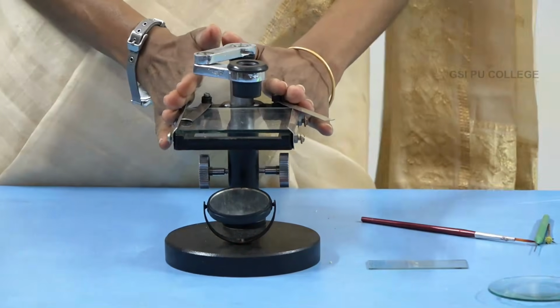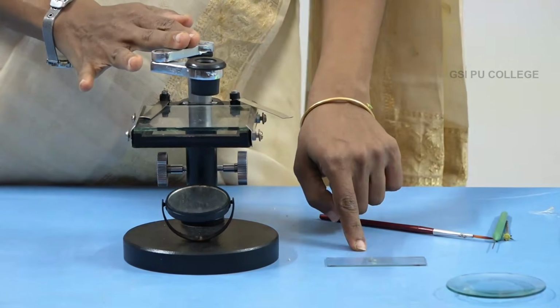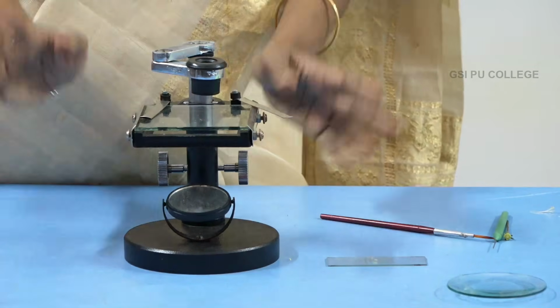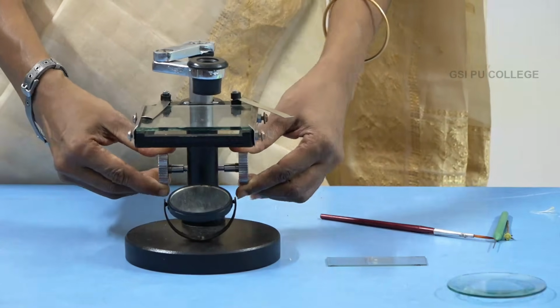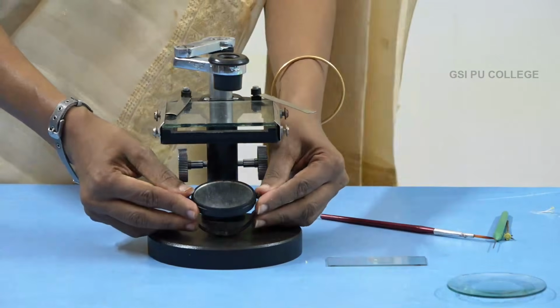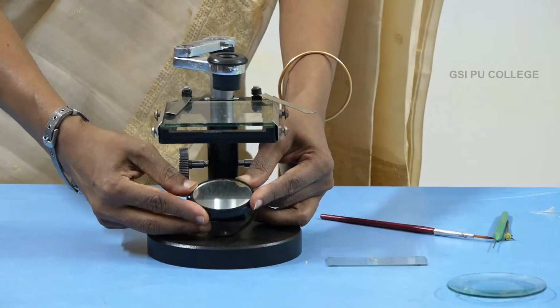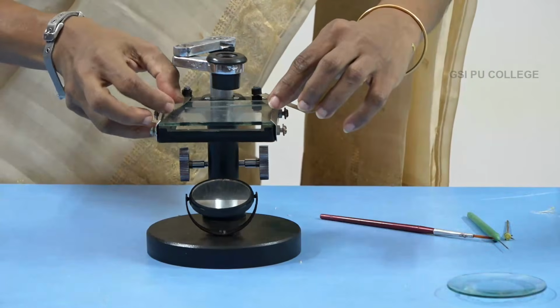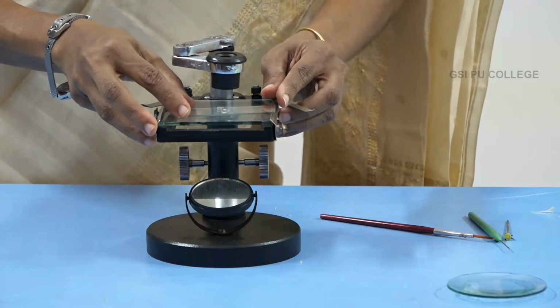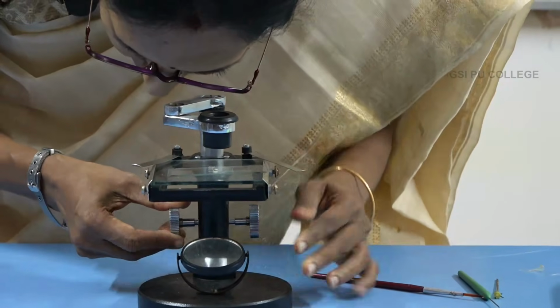This is the dissection microscope. Why do we have to use this microscope? Because we have to observe the whole mount, the complete section. For that we are using this microscope. It's very simple, with only one adjusting screw or knob. What you have to do is, this is the mirror. First you adjust the mirror towards the light like this, then keep the slide, and then by observing through the eyepiece you move like this.